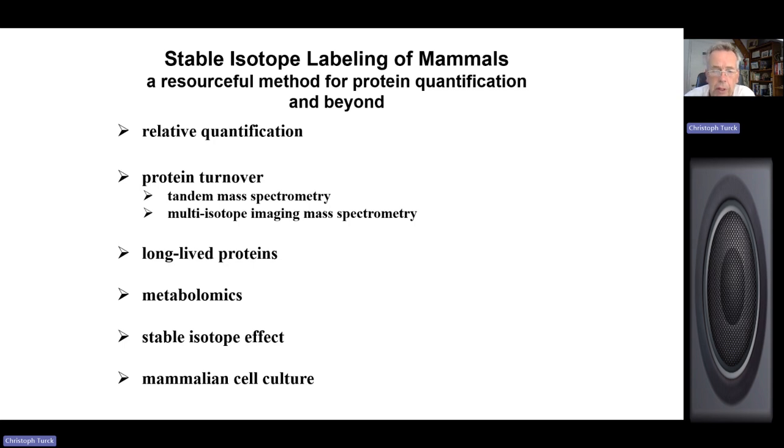I will tell you initially about relative quantification of proteins by mass spectrometry, just like the Yates lab was doing in the beginning. Then I'm going to switch a little bit to not looking at the static proteome, in other words, not taking snapshots, but we got interested in protein turnover, which appreciates a lot more the dynamic nature of the proteome. As we all know, unlike the genome, which is static, the proteome is a dynamic entity. In order to understand it, it's not enough to take a snapshot photo, you actually have to take a movie.